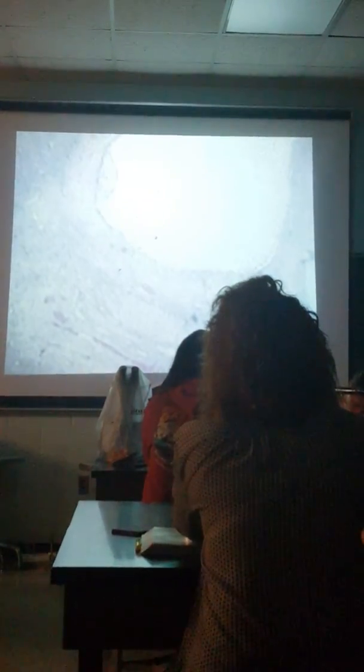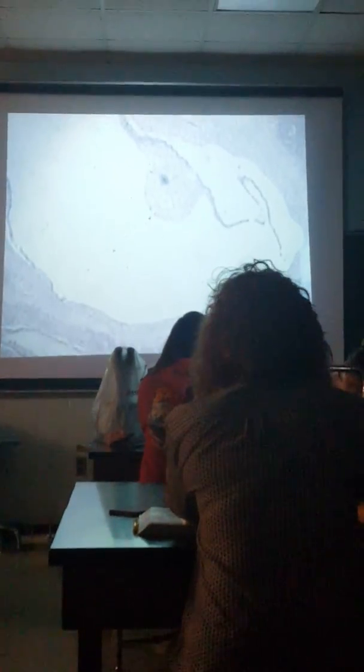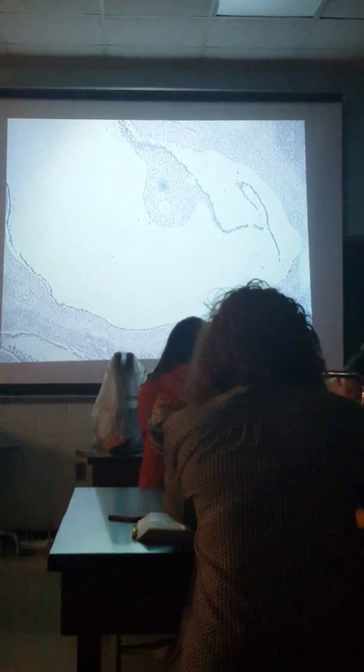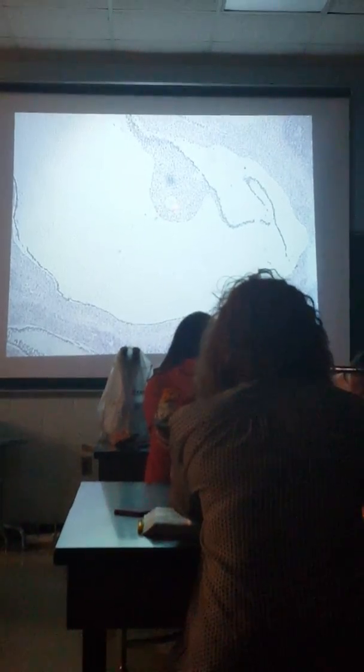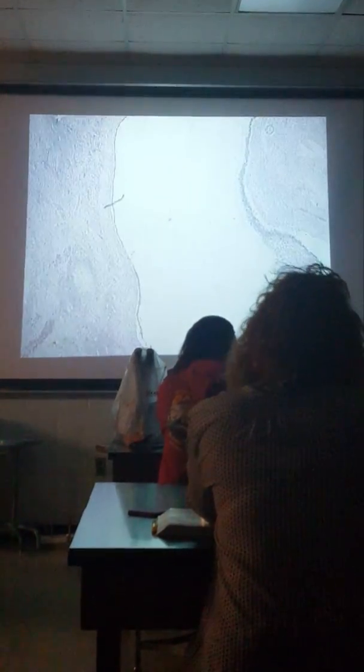Yeah, so these are Graafian follicles. A larger ovary. They're really gigantic and they're ready to go. I'll try to find one that's, I mean, it's kind of squashed. It's not the roundest one. But here we see the oocyte. We see the corona radiata. We see the zona pellucida, theca externa, theca interna, all that getting ready to ovulate.